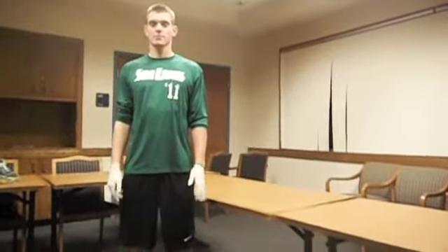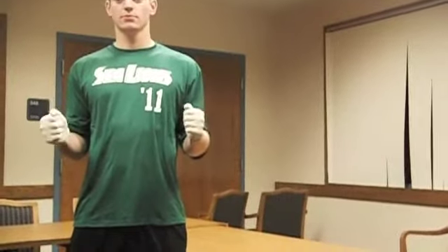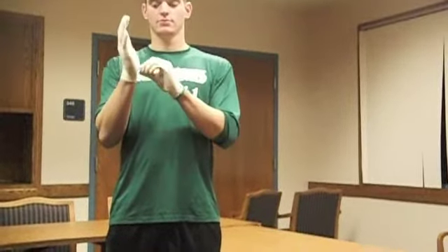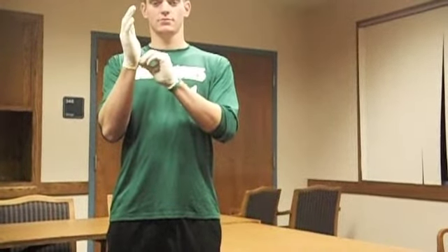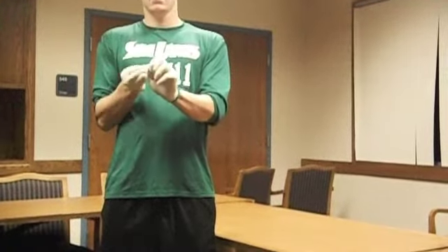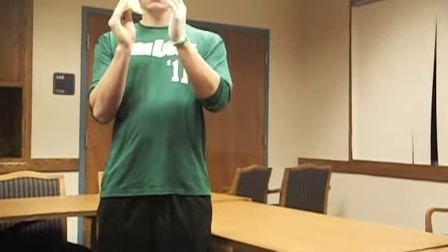Glove removal is a crucial part of being a first responder. Remember, never touch your skin to the contaminated side of the gloves. First of all, carefully pinch the outside of the first glove near the wrist. Secondly, pull the glove towards your fingertips until it is positioned inside out, but make sure all the fingertips stay in the glove.